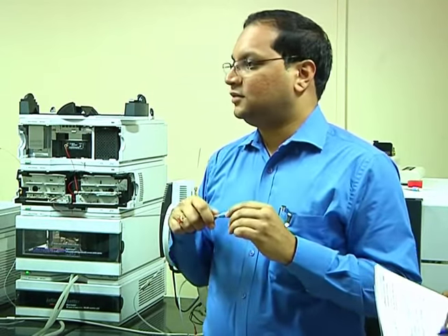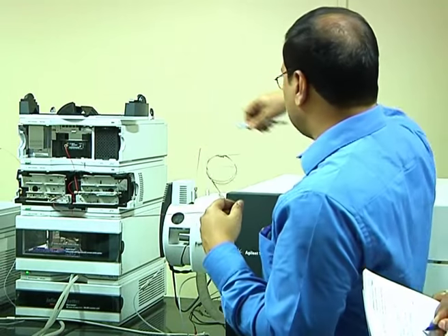Has anyone used HPLC? If you have used it, what is the readout of an HPLC? If you inject the sample, how do you see the chromatograph? I'll ask you a question. If I give you a chromatograph of an HPLC UV, and there are 6 peaks, what does it mean? 6 compounds. You get 2 dimensions in your analysis. One is compound, another one is retention time. Based on compound you can do that, but will it serve my purpose?